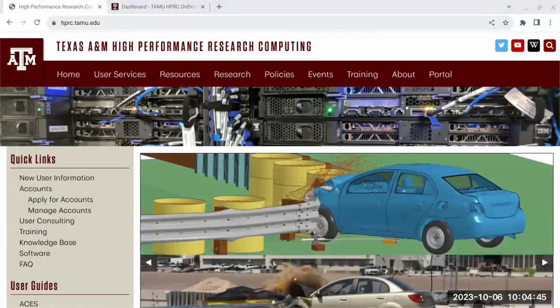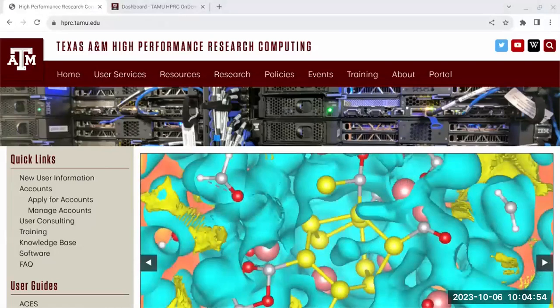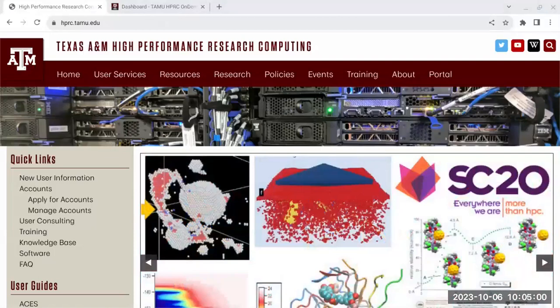So today I'm going to cover some concepts of DNA sequencing, and then I'll show you some of the tools that we have on our clusters. We'll be using the GRACE cluster, and we'll be running some job scripts, or at least one job script, and then going over some other useful tools on the cluster.